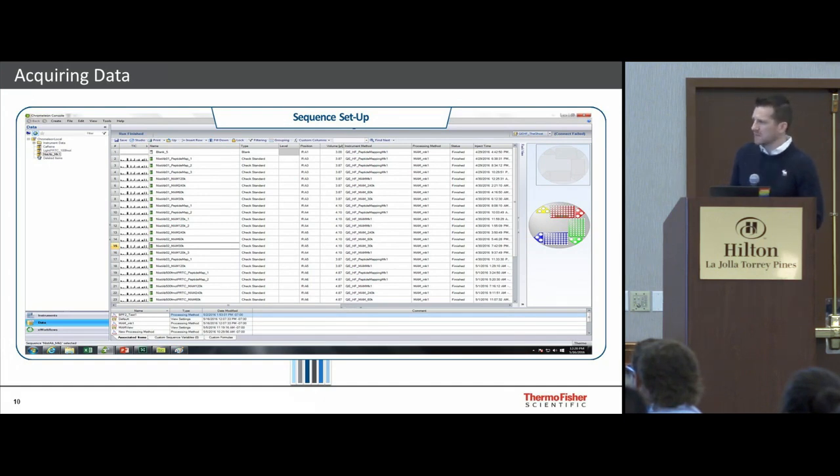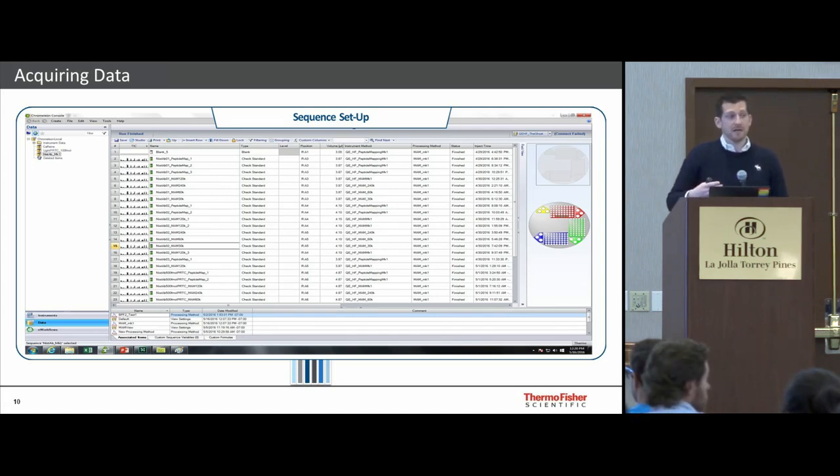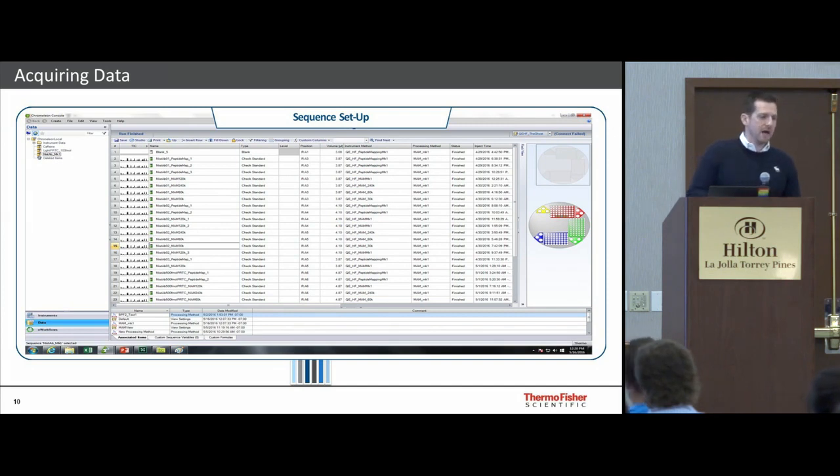There's a whole bunch of compliance tools. I get asked about this. You can turn them off or on, depending on whether you need to be GMP or not. You can have gated user access. So you can say, okay, only someone with credentials can log in, can actually calibrate the instrument, can actually tune the instrument. You have to supply this first before you can even access the Exactive tune. You can say who's allowed to electronically sign. So for instance, you can say I'm not allowed to electronically sign the report, but I can submit a report, and then my boss has to approve it.